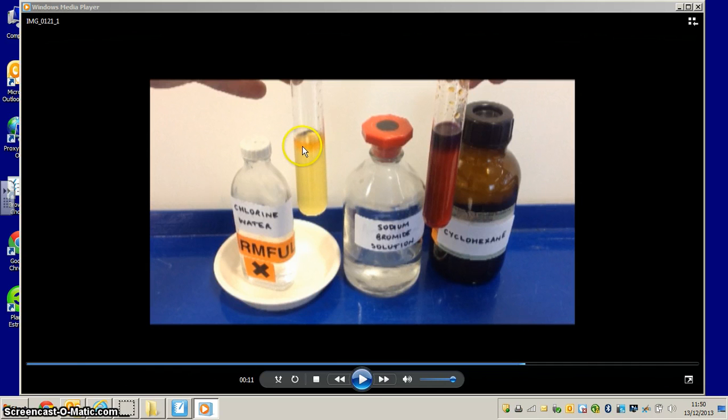You can see the bromine is an orange colour. So the chlorine has become chloride in here, so we have sodium chloride, and the bromide has become bromine, and that's dissolved in the organic solvent, the cyclohexane.